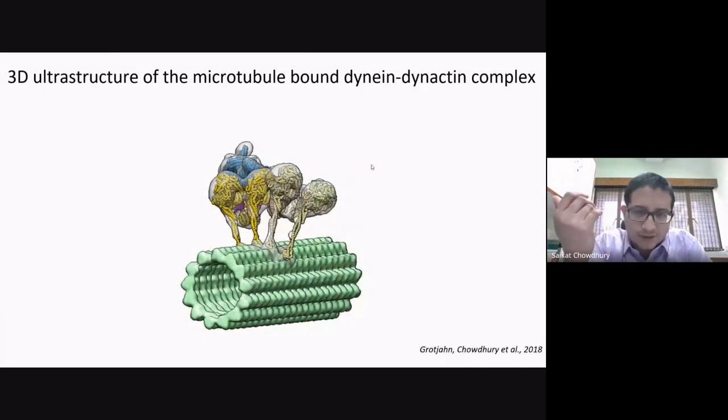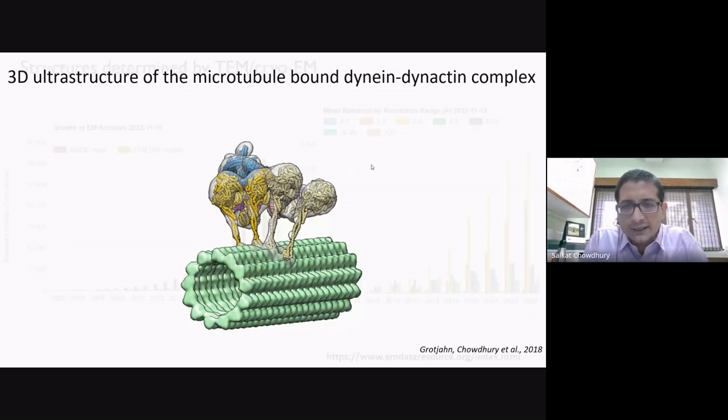And today, people are doing this inside a cell. Unfortunately, in India, we do not have those instruments to do this inside the cell. But maybe someday in the near future, we should be able to procure them. And then we can literally solve structures of these complexes from within the cell, and you don't even have to purify them, by using a combination of tomography and then making thin sections of vitreous samples.